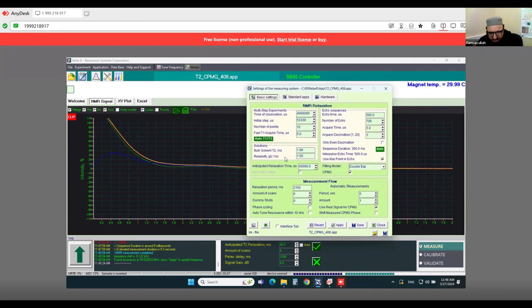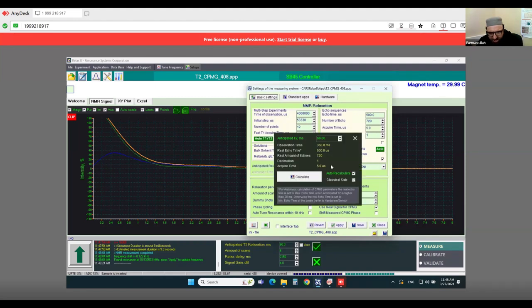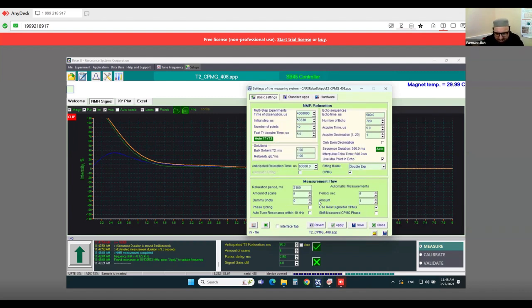I also told you before in my first experiment that I had to adjust this. The way I have learned these parameters, let's go with the same setting and see what happens and the result.